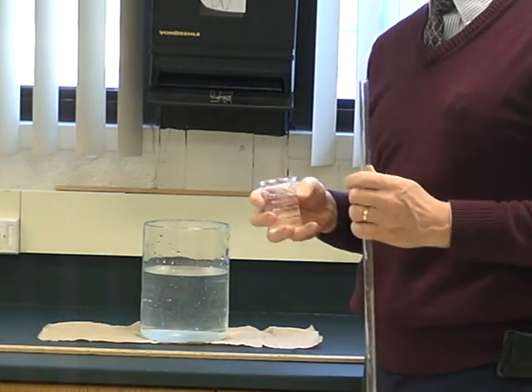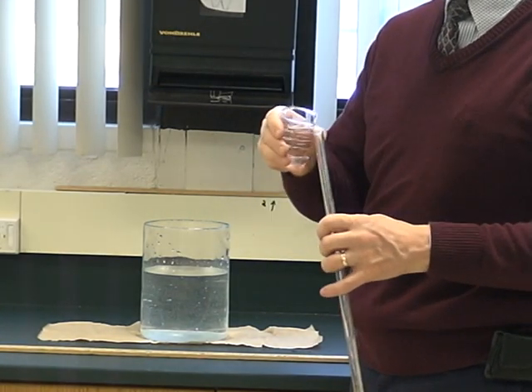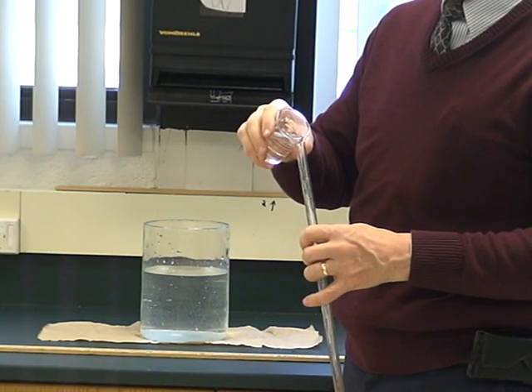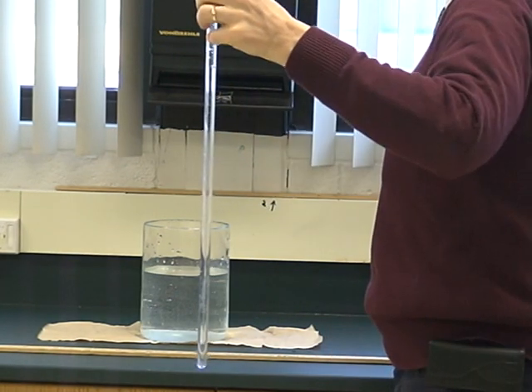A simple little setup here that we're going to use to show you the calibration from water to mercury. I have just a gas collecting tube here and I'm going to add a certain amount of water in this tube.